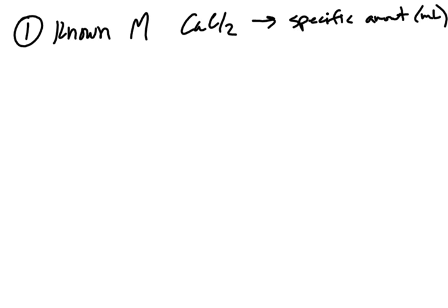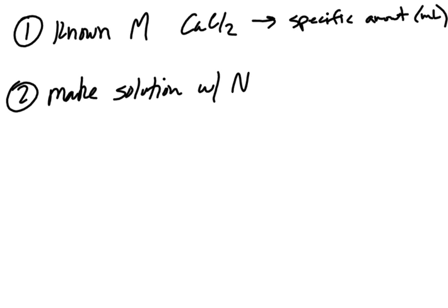And you are also going to make a solution with the sodium carbonate, and it's going to be in a range of mass, right? It doesn't necessarily matter how much water you use because the water is going to be dripped down anyways, okay?